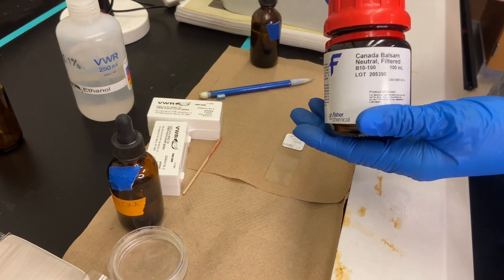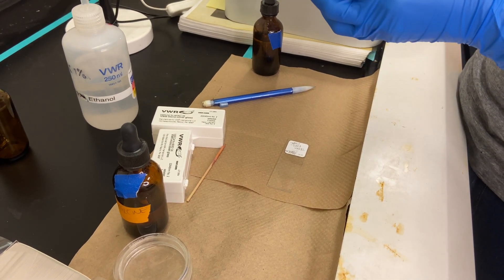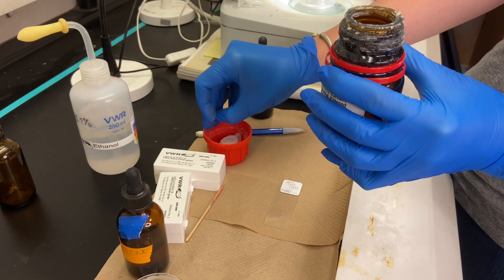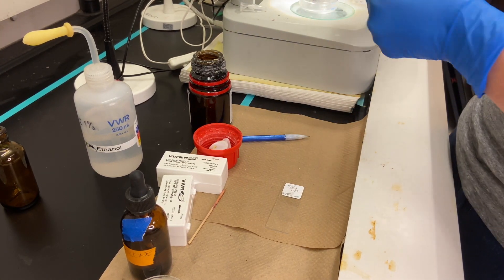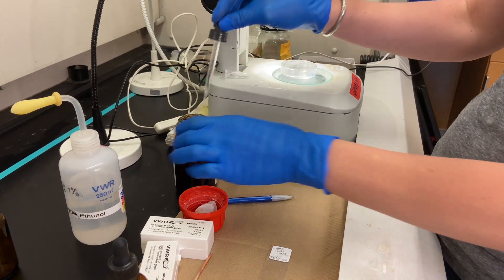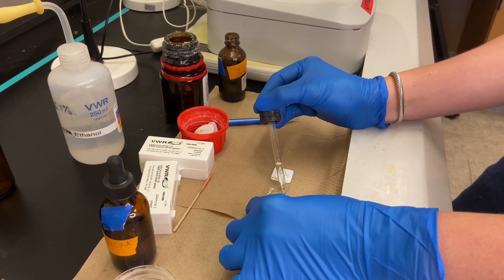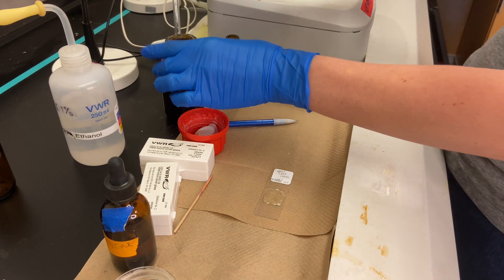We have Canada Balsam, which is one of the best mounting agents. It comes diluted with xylene, which makes it thinner and able to be pipetted onto the slide, and it will dry thick and solid. If your balsam is too thick, you can add more xylene to it. If your balsam is too thin, you can let it air out a bit with the lid off and that will thicken it up. I'm going to suck up some of the balsam using the dropper and place a small amount on the slide in the center. Be careful not to apply too much — that will make your whole slide sticky and very messy, though a little bit extra is okay.